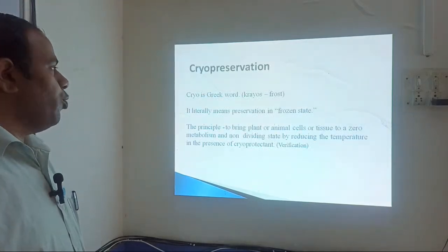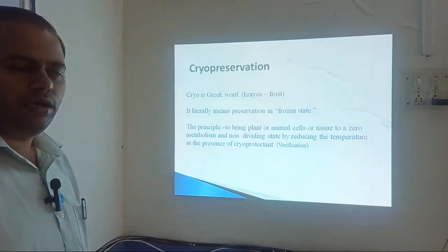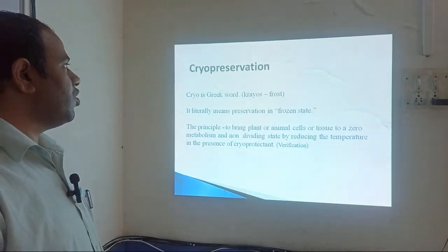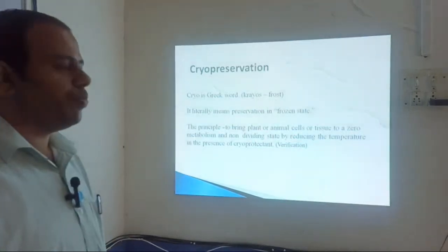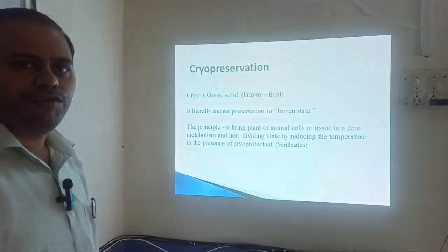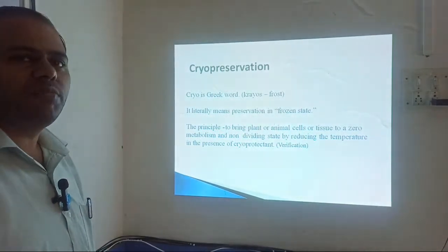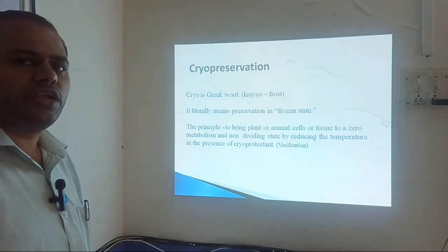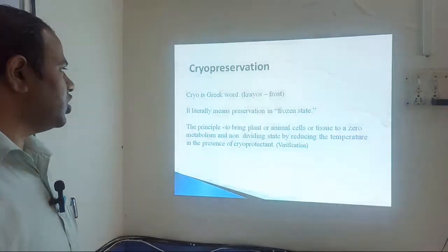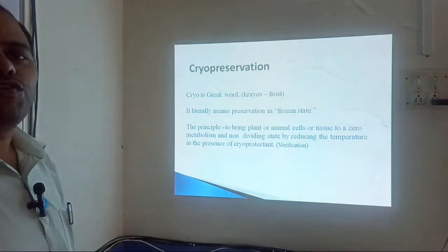So the word cryopreservation is derived from a Greek word. Here, cryos means frost or cold, and preservation means preserving in a cold condition or in a frosted condition. That is called cryopreservation. So it literally means a frozen state.